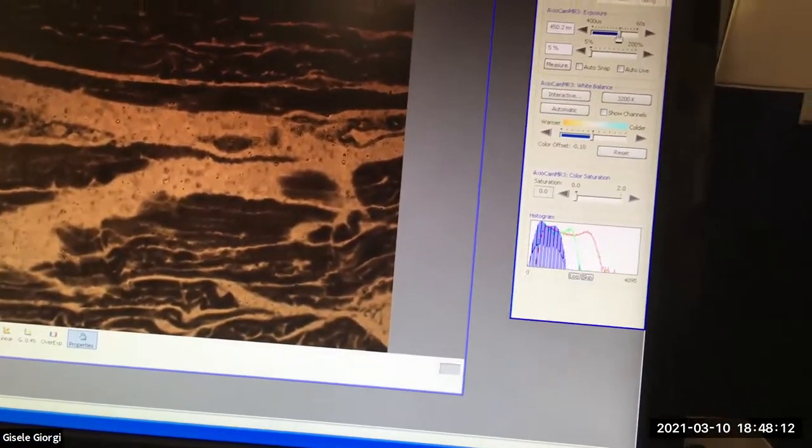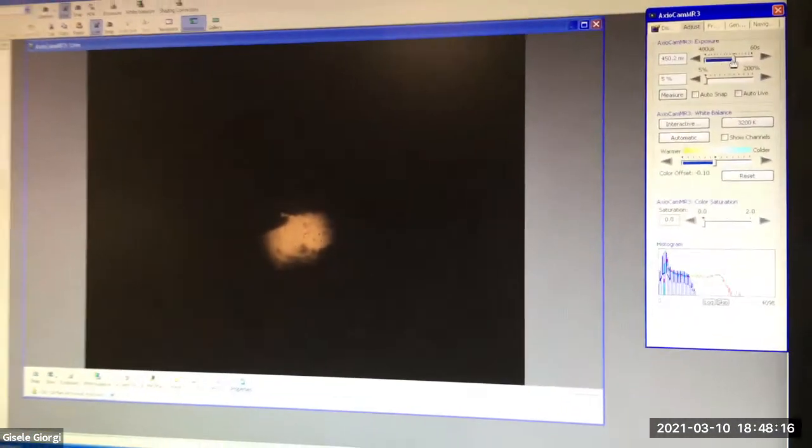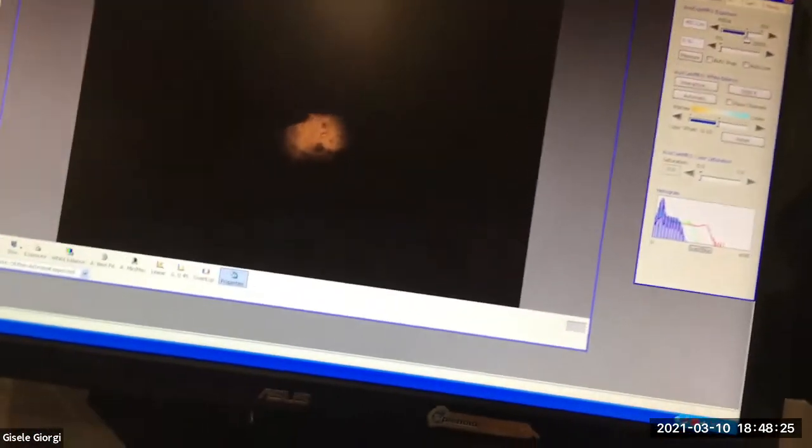And now I'm going to go ahead and stop down. There it is. I stopped down the condenser and it looked like it was in focus before. It's not in focus anymore, right? I didn't do anything. I didn't move it. It's just that I can see better. And I might just get rid of this since it's distracting me a little bit. And you can see that it's almost in focus, but not quite perfect.